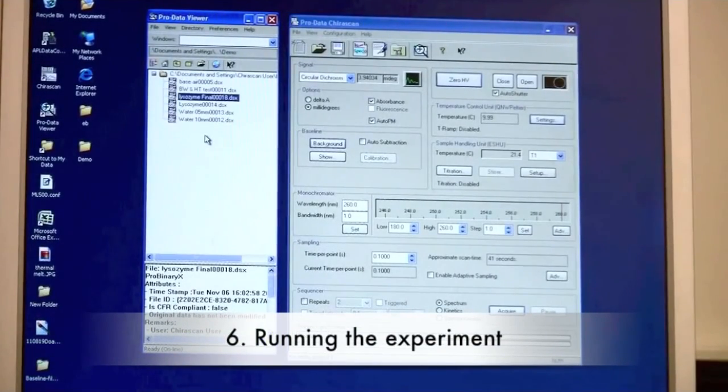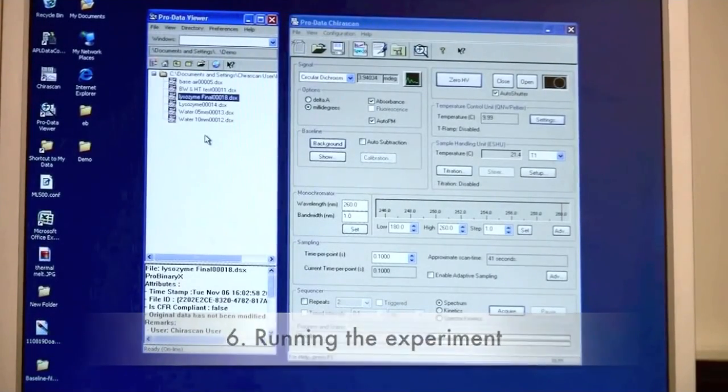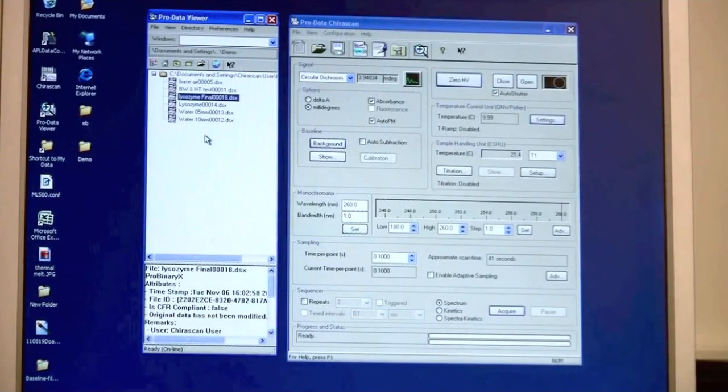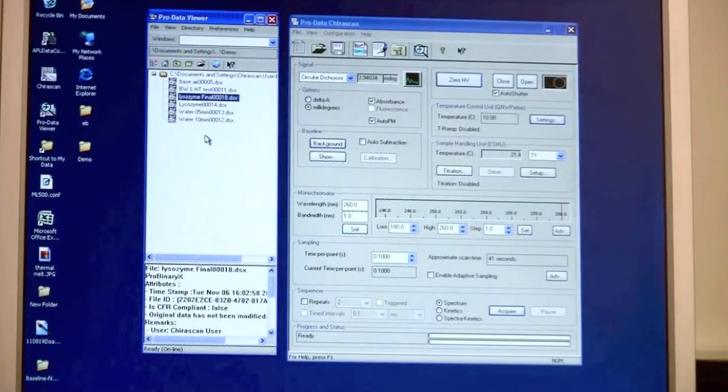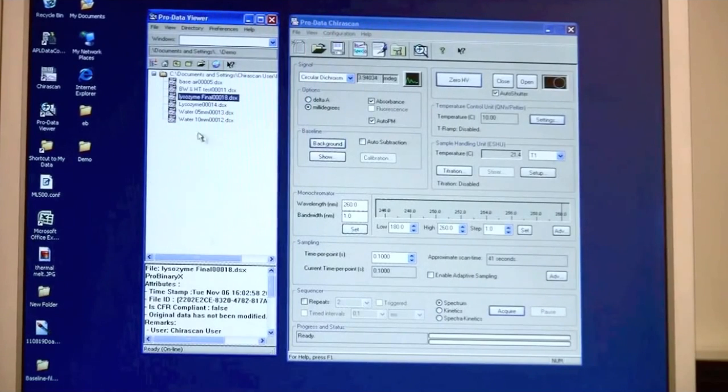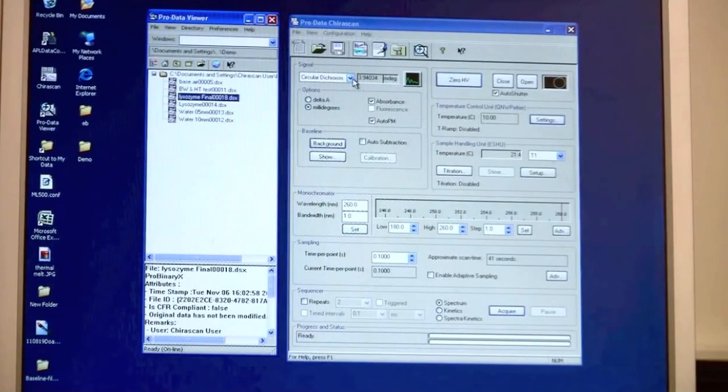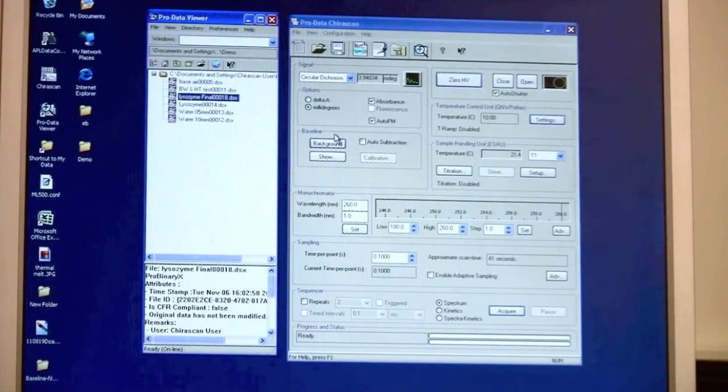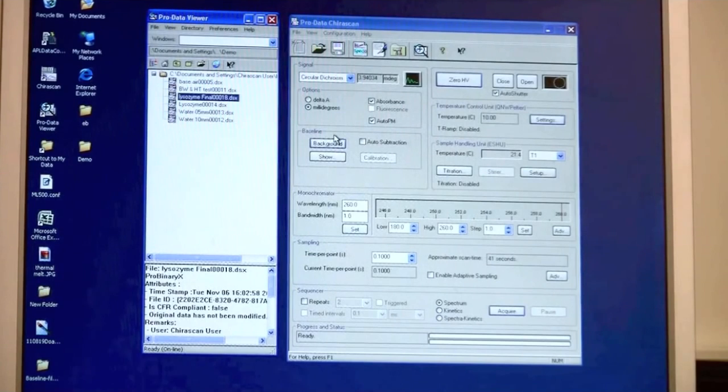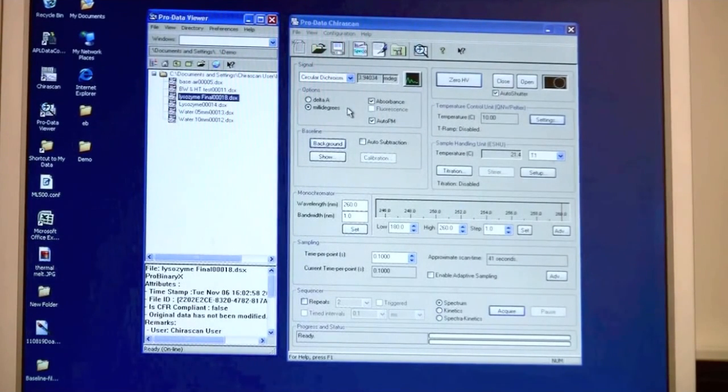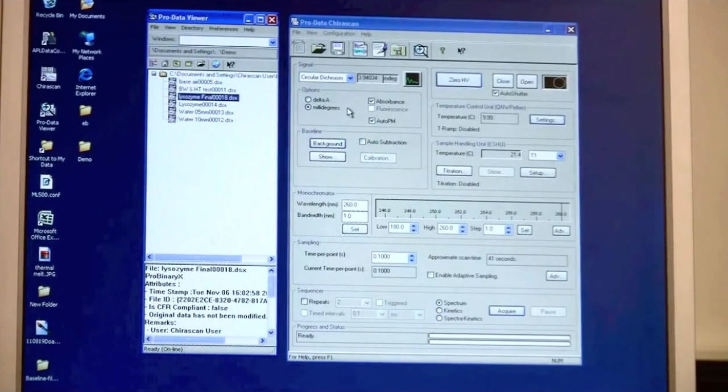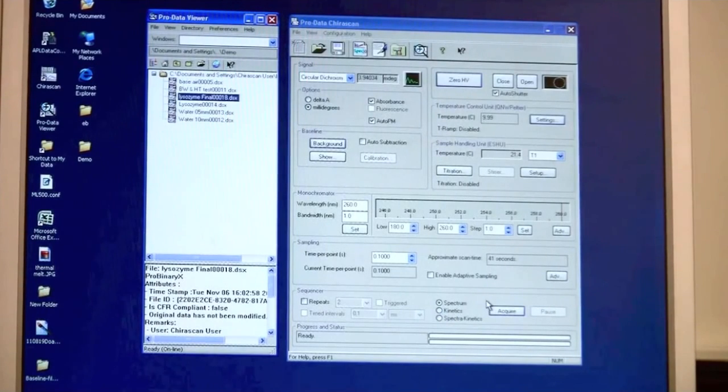Since I have already gone over all the settings of wavelength, range and so on, I won't repeat that. But when you are setting up your experiment, the important thing to remember is to change the signal to CD mode, collect your background against your buffer, preferably tick the absorbance option so you always have that as a control, and then you acquire your data.